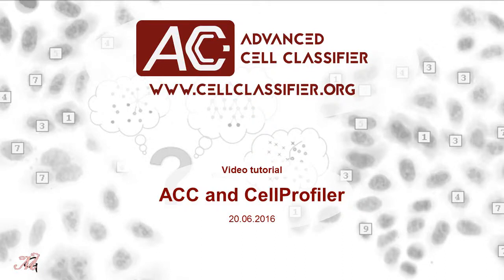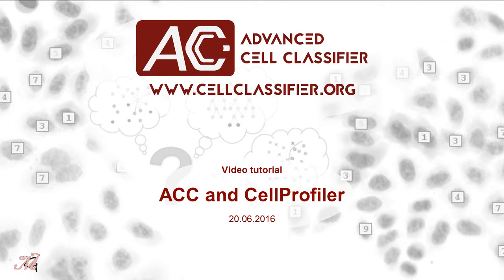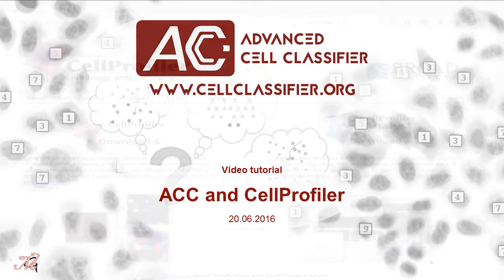Welcome. In this tutorial, I will briefly show you how to use Cell Profiler to segment your images, extract cellular features, and then analyze your data using Advanced Cell Classifier.